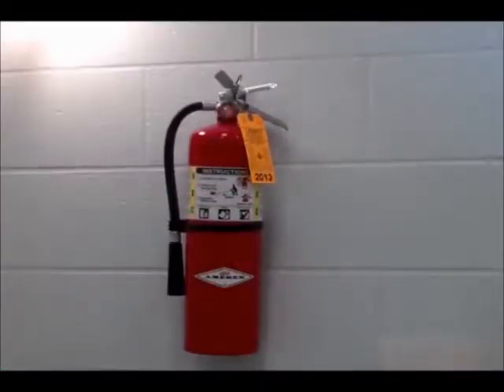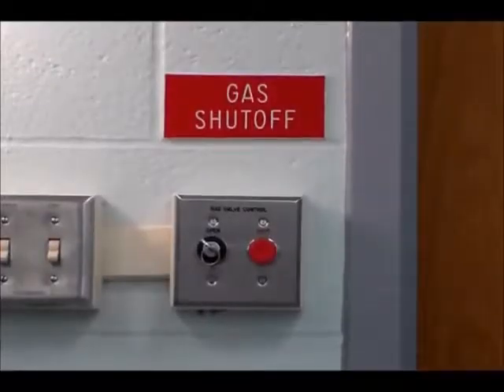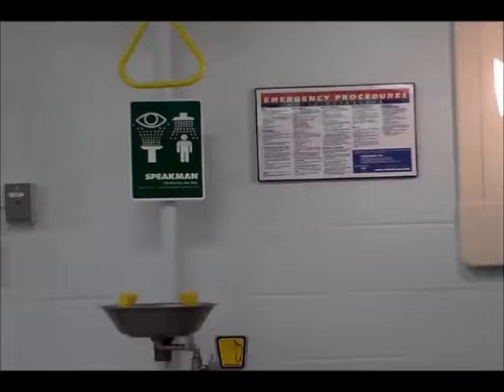Safety features include a fire extinguisher, a gas shutoff, safety shower, and an eyewash station.